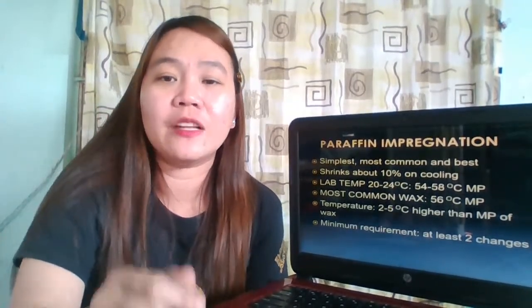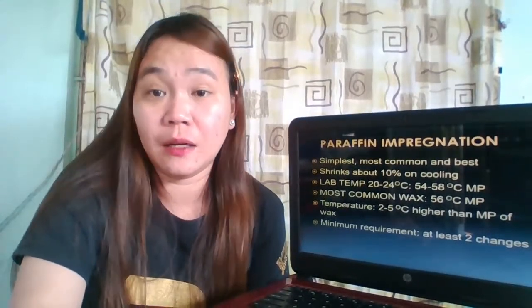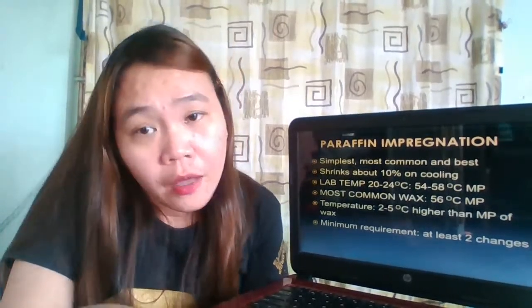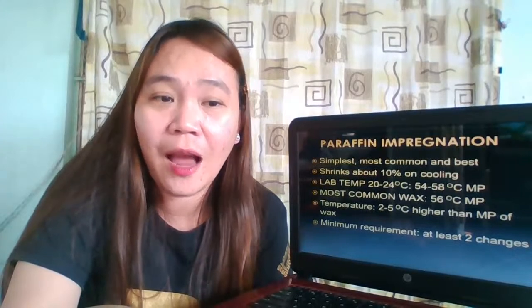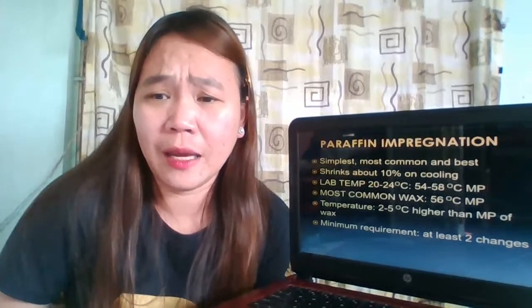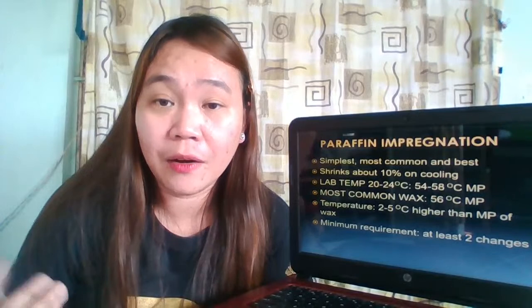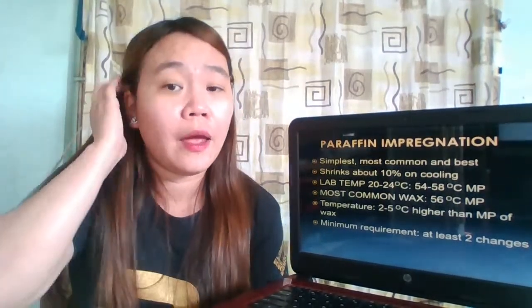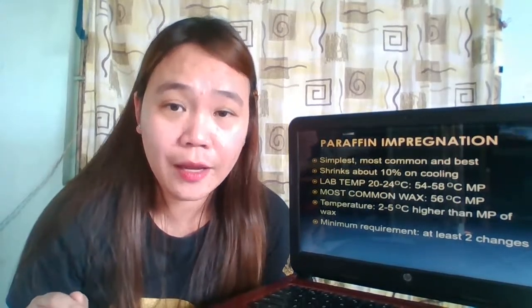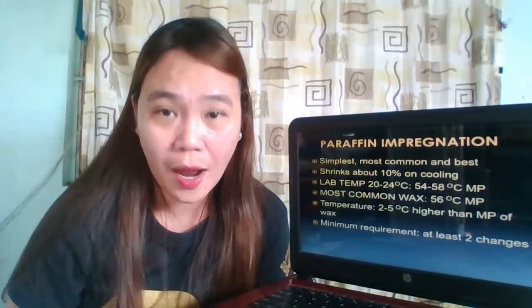Anyway, apart from the laboratory temperature, what else do we have to consider? We have to consider how hard your tissue sample is. What is our rule again when it comes to the hardness of our paraffin or our impregnating and embedding media? What is our rule? The rule is the higher the melting point, the harder the wax.